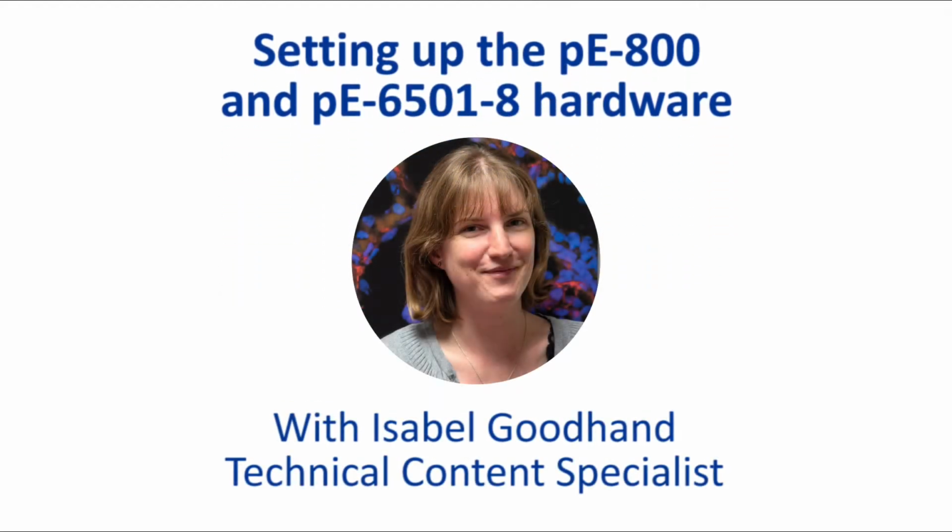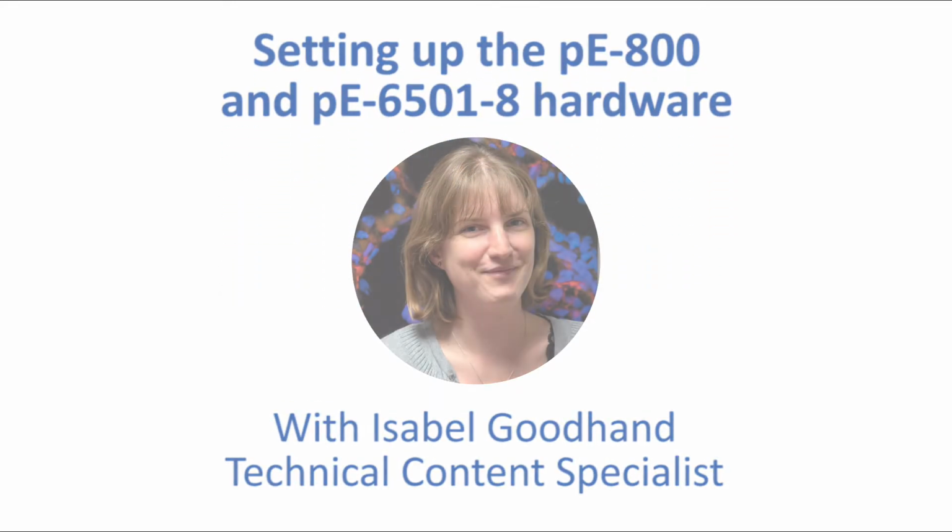Hi, I'm Isy, Technical Content Specialist, and today I'm going to show you how to connect the 8-channel pE-800 Illumination System to the pE-6501-8 USB controlled trigger box.